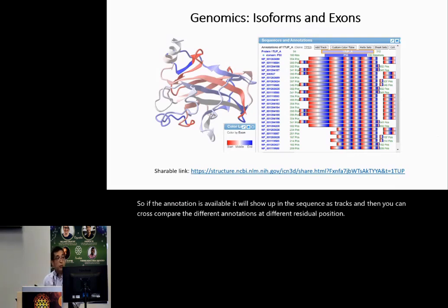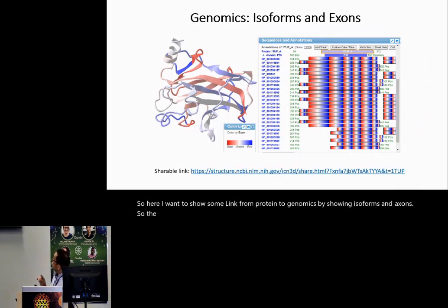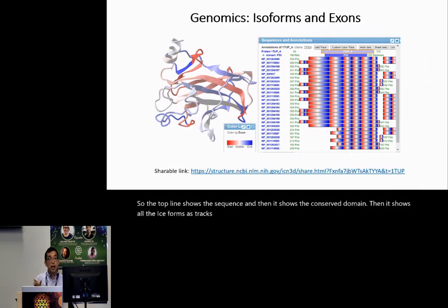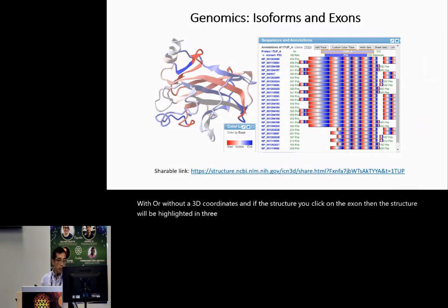Here I want to show a link from protein to genomics by showing isoforms and exons. The top line shows the sequence, then the conserved domain, then all the isoforms as tracks. All the exons are shown with or without 3D coordinates. If there's a structure, you click on the exon and the structure will be highlighted in 3D.